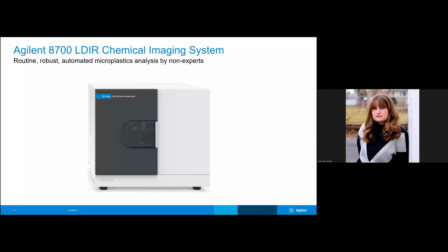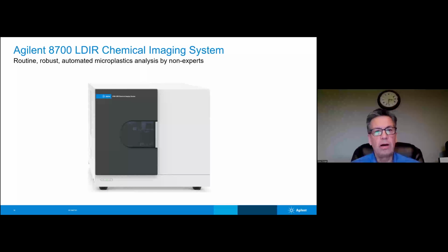I'm happy about that. The first one is, what challenges do you see in operating this in remote areas? Okay. So you just need a source of electricity. It's stable, and so you don't need to put it on an air table or anything like that. But it requires dry air, a dry nitrogen purge to operate. So that would really be the only challenge. If you have a source of electricity, then you can have a generator for the purge.